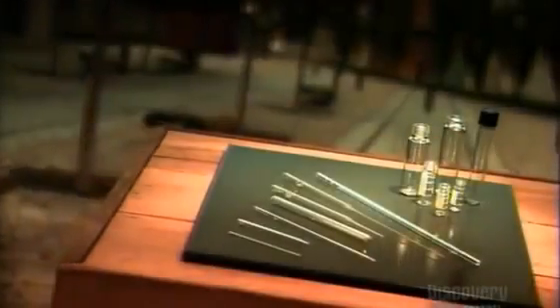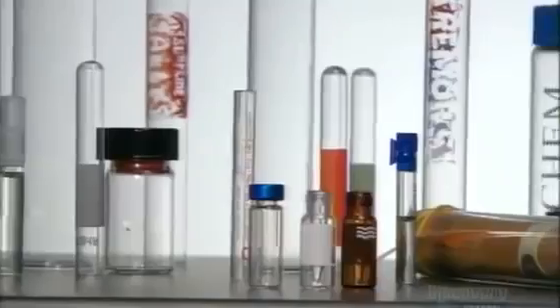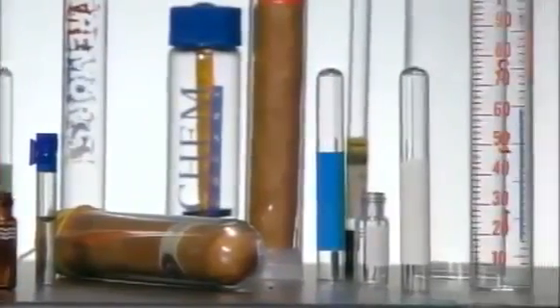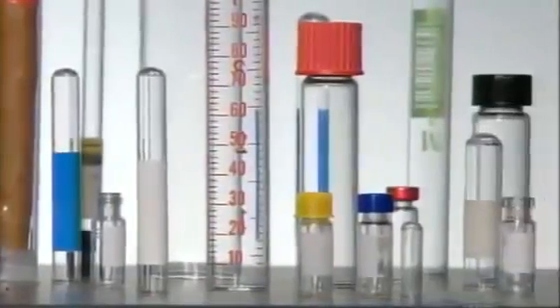Their size, shape, and function run the gamut, ranging from beakers and test tubes to petri dishes and vials. Mixing, measuring, storing, or sampling is all in a day's work for a piece of laboratory glassware, built to withstand even the most potent of chemical concoctions. Many scientific breakthroughs are born here, inside laboratory glassware, the tubes scientists use to hold liquid samples for chemical experiments.